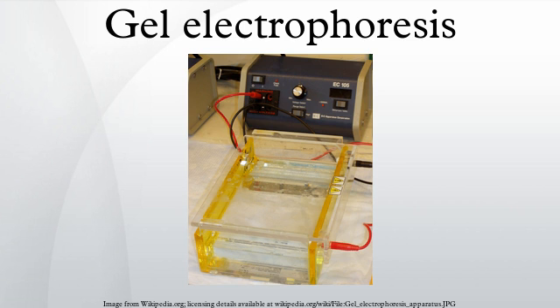If several samples have been loaded into adjacent wells in the gel, they will run parallel in individual lanes. Depending on the number of different molecules, each lane shows separation of the components from the original mixture as one or more distinct bands, one band per component. Incomplete separation of the components can lead to overlapping bands, or to indistinguishable smears representing multiple unresolved components. Bands in different lanes that end up at the same distance from the top contain molecules that pass through the gel with the same speed, which usually means they are approximately the same size.